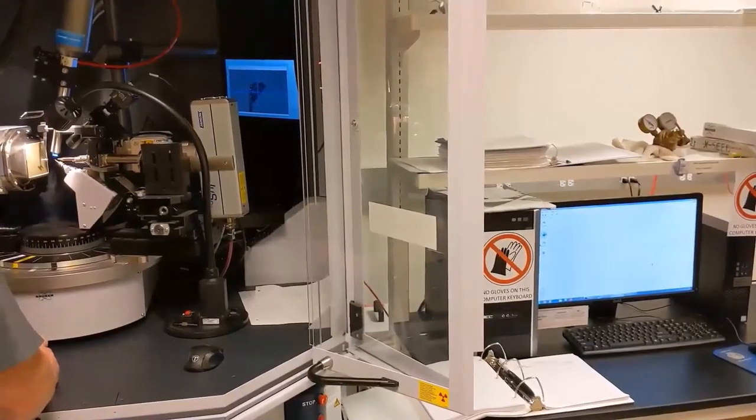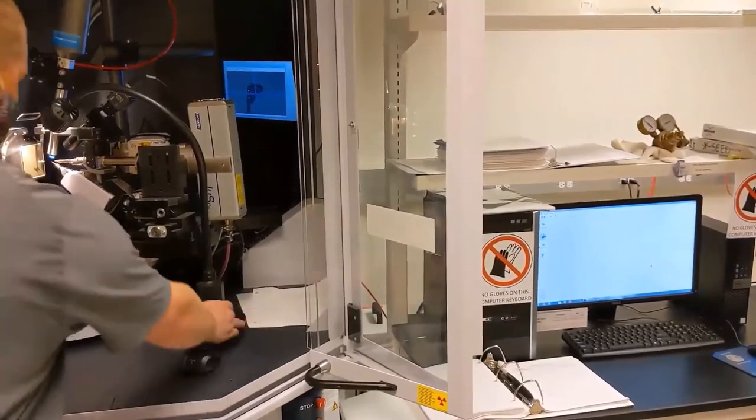When I'm finished centering, I put the tool back in its place, turn off the light, and gently close the doors.